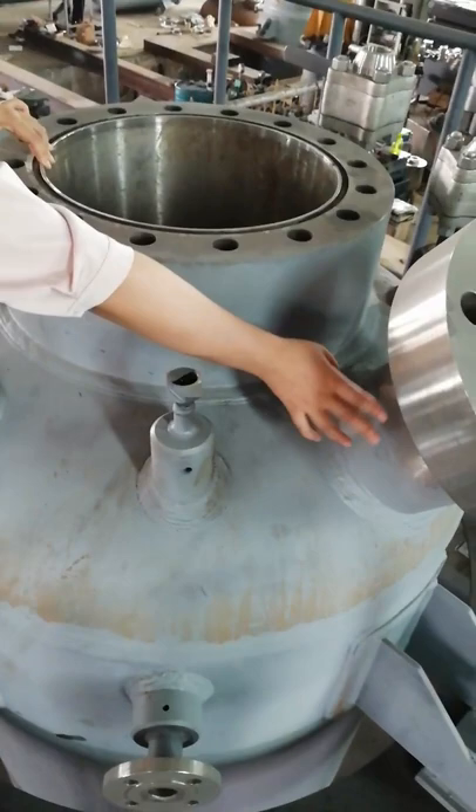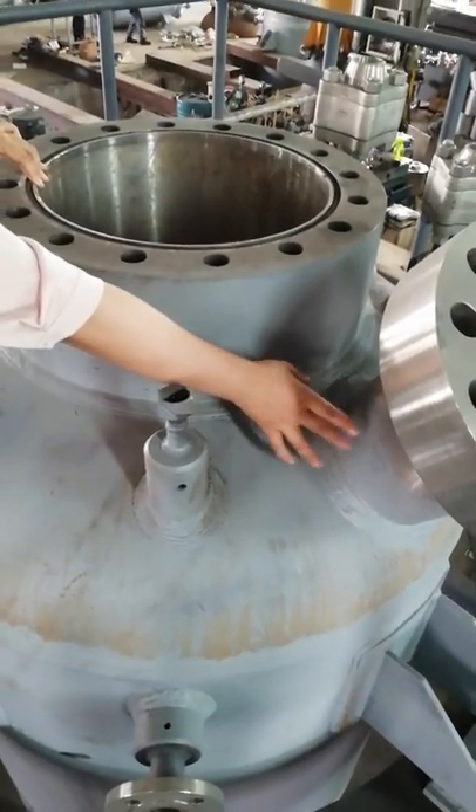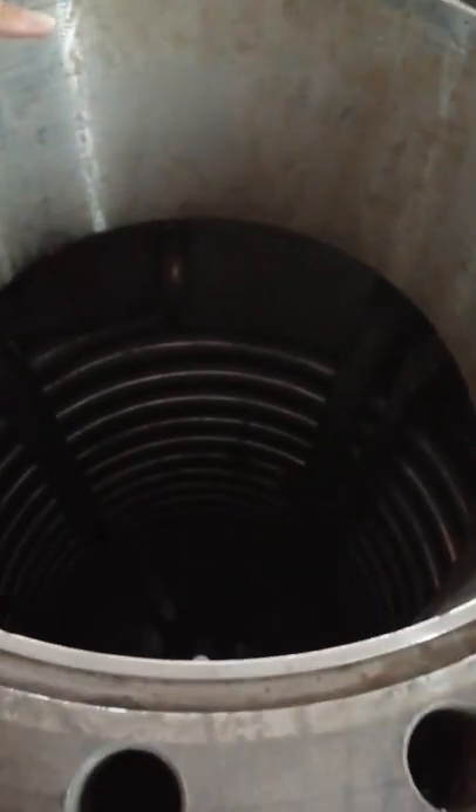The flange is stainless steel, and the inside lining plate is also stainless steel, with a cooling coil to lower the temperature inside the reactor kettle.